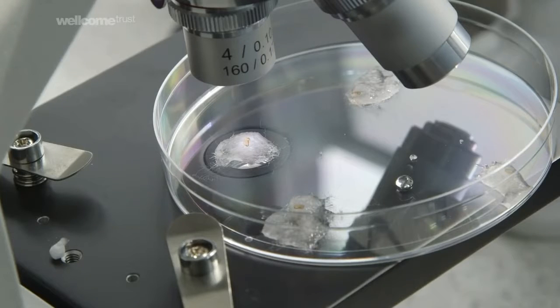Now the cotton wool is there simply to trap the Daphnia, stop them moving around. So the trick is, when you place the Daphnia down on the cotton wool, is to make sure that they're hydrated, but they are not so hydrated that they are free to move around on the petri dish. Once they're in isolation, we can then put them under the microscope and start observing.